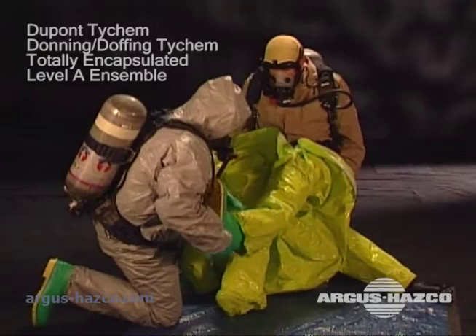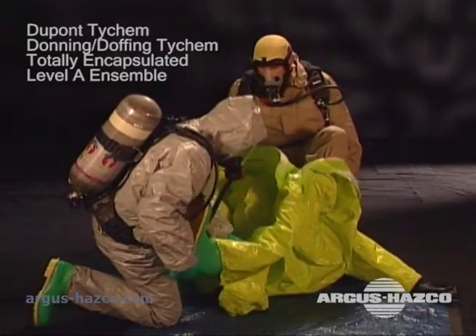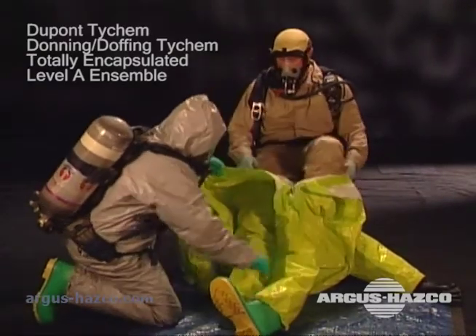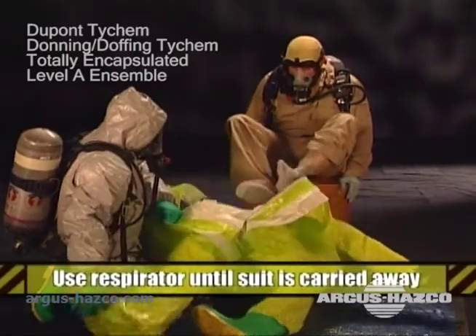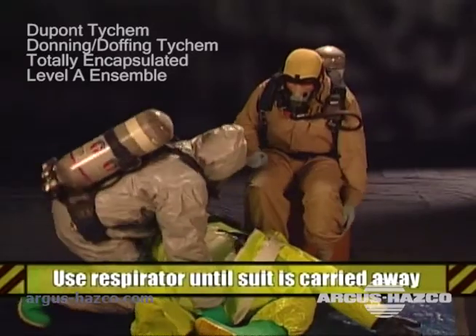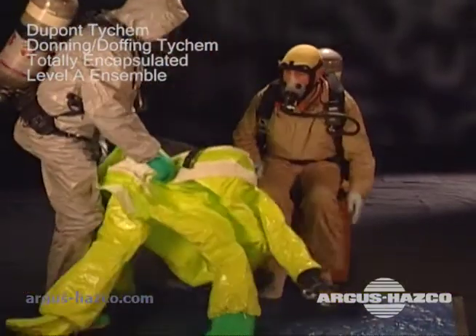Sit down while the assistant removes your boots and the legs of the garment. The assistant then carries the suit away to be placed in the proper container for disposal. The wearer should continue to breathe through the respirator until the suit is fully doffed and removed from the area.